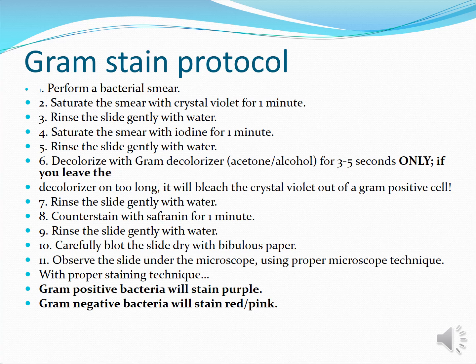Then rinse the slide with water. Counterstain with safranin for 1 minute. I told you 30 seconds; 30 seconds is more than enough. Rinse the slide gently with water. Carefully blot the slide dry with bibulous paper. Observe the slide under the microscope. Use proper microscopic techniques with special and proper staining care. You can see that the gram-positive bacteria will be purple and gram-negative will be red or pink in color.